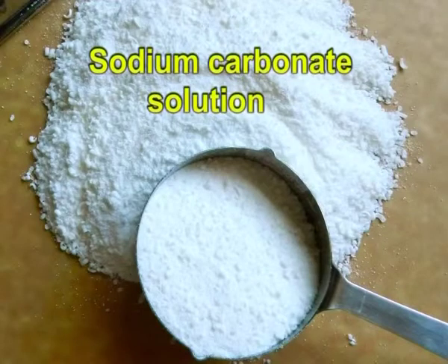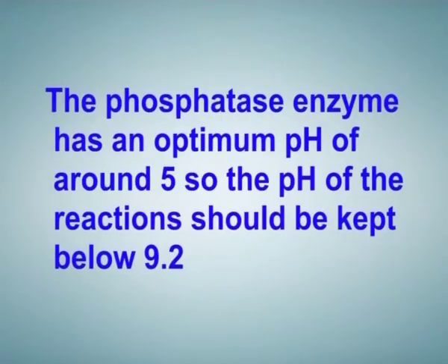Phenolphthalein phosphate has the property of being colorless in alkaline solution, whereas free phenolphthalein produces a pink color. The amount of enzymatic activity can thus be estimated by the intensity of color produced from a standard reaction mixture when sodium carbonate solution is added. The phosphatase enzyme has an optimum pH of around 5, so the pH of the reaction should be kept below 9.2. Any buffer system can be used, including buffer tablets.